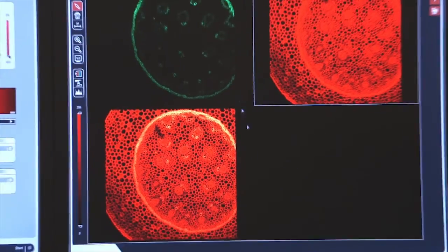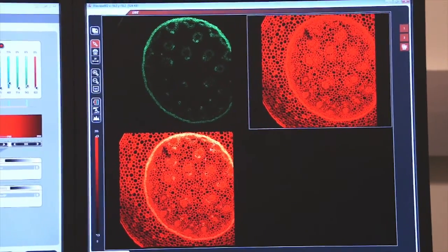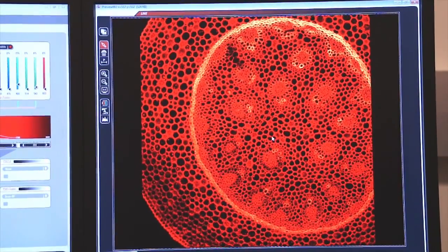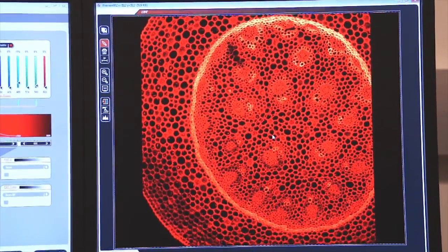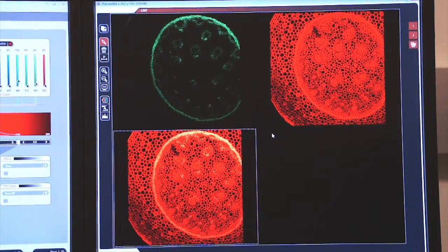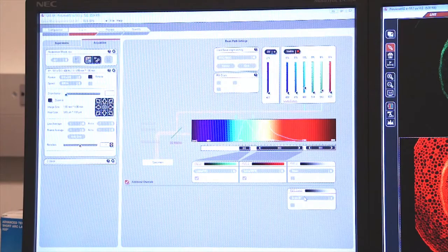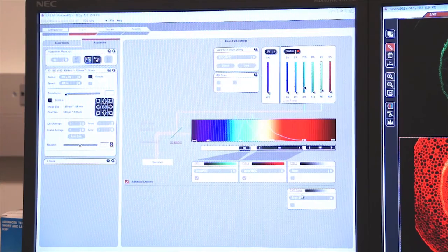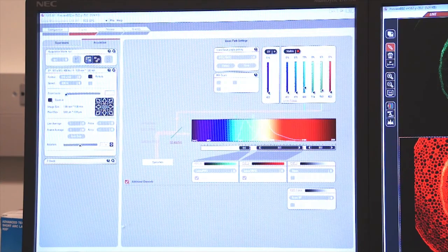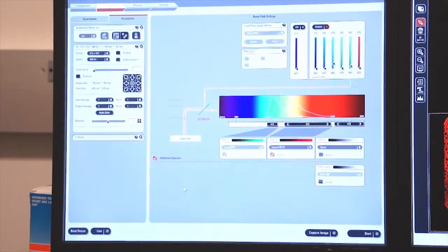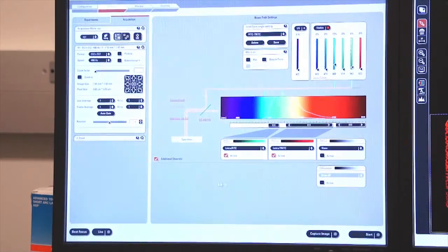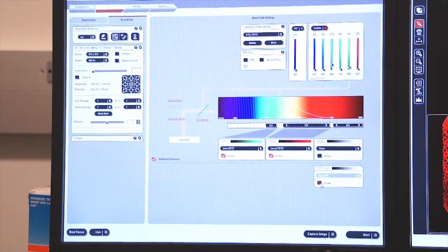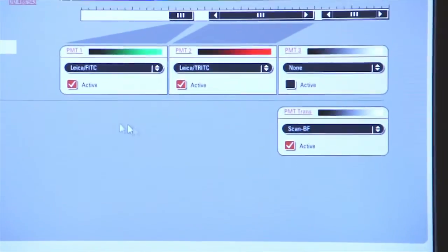Once again, I will double click on my image and again I can see my two captured images and my composite image which is generated by the computer. I also have another photomultiplier tube that can be used for transmitted light. So I'm going to press stop, stop the live imaging and now I'm going to select the photomultiplier tube for a bright field image.